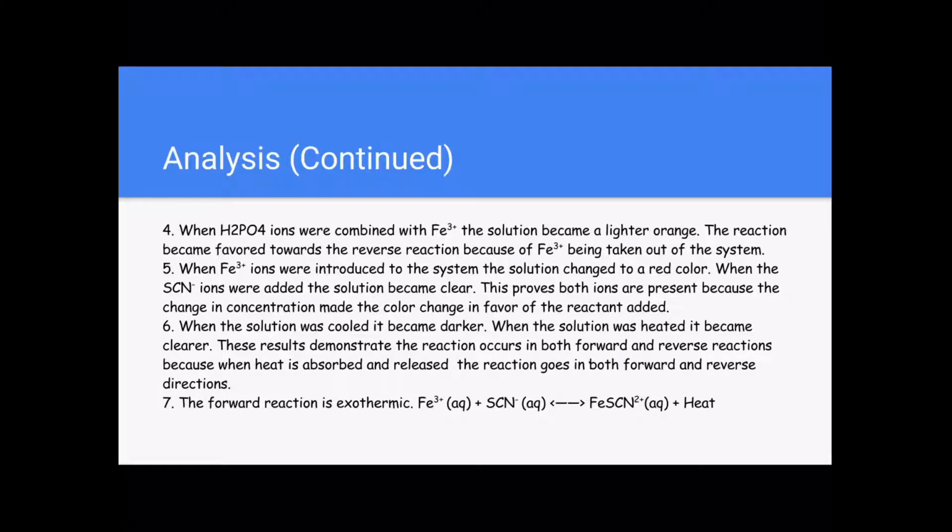When iron ions were introduced to the system, the solution changed to a red color. When the thiocyanate ions were added, the solution became clear.